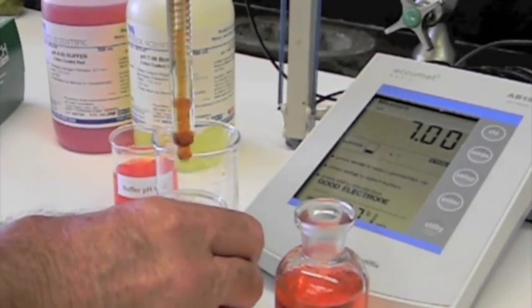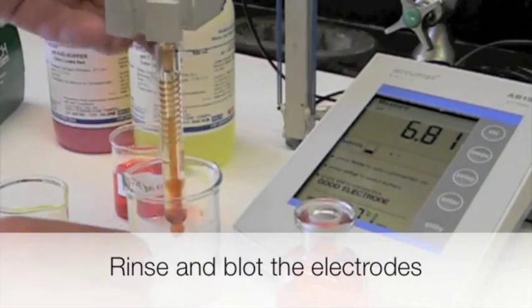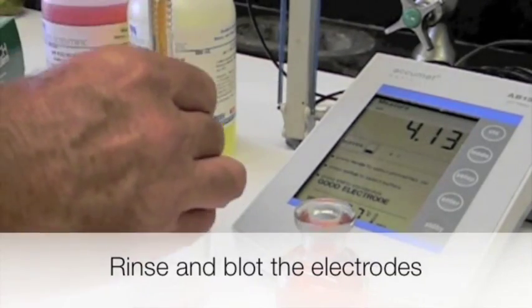Rinse and blot the electrode. The meter is now ready to use for measuring the pH of food samples.